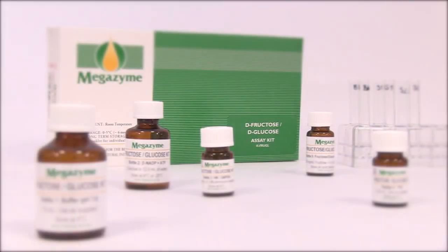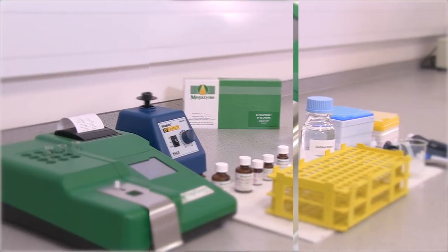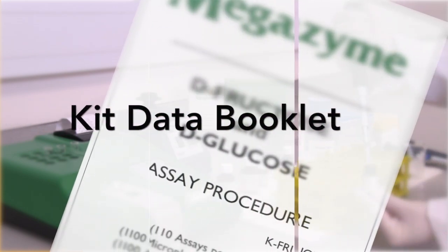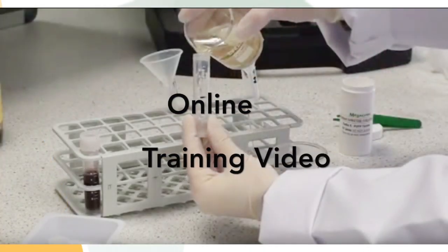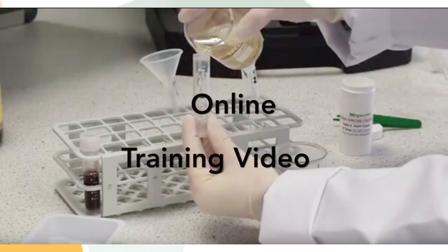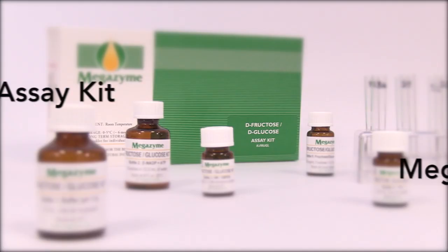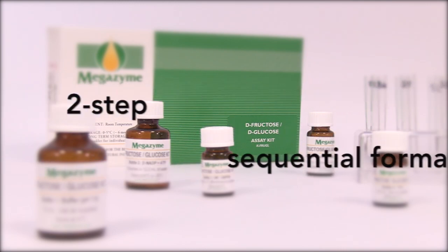The MegaQuant Wave can be used to perform many of the Megazyme test kit assays using manual assay formats. Prior to performing the Megazyme test kit assays, it is recommended that the user familiarises themselves with the relevant kit data booklet and the supplementary training video demonstrating some general principles of analysis, both of which are available to download from the Megazyme website.